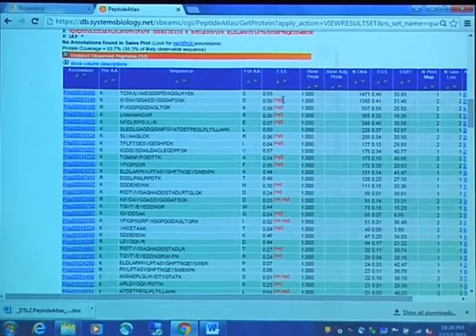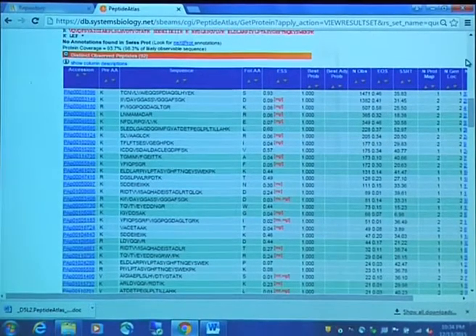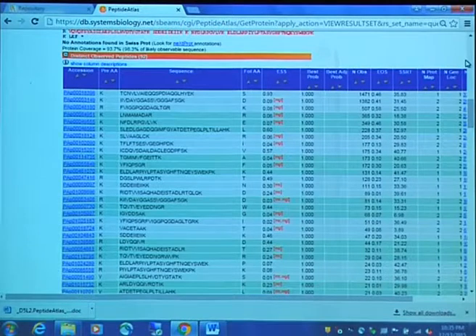So there's a little bit of text here that says MGL, and there's a definition of it at the bottom. But basically that means multiple genome locations. And the reason that that was less highly rated is that it is seen in other proteins, and so it's not purely indicative of this particular protein. And so we essentially, PeptideAtlas is very peptide-centric, and so we essentially demote it because it has these multiple genome locations.